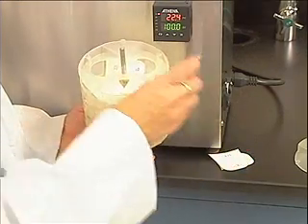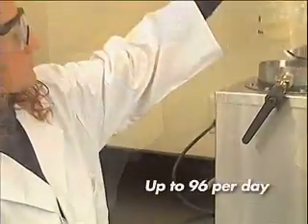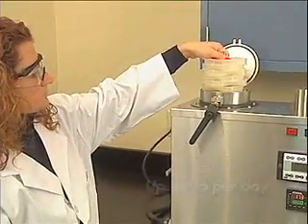With the ANCOM fiber analyzer, one technician can complete up to 96 fiber determinations during the normal workday and still complete other work.